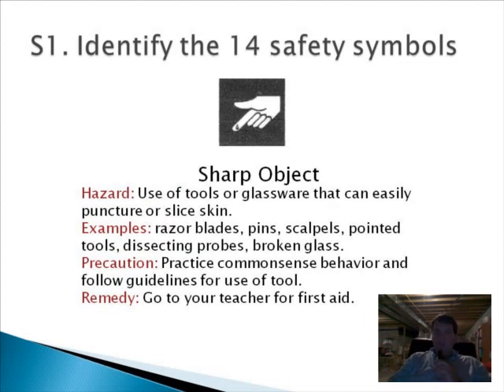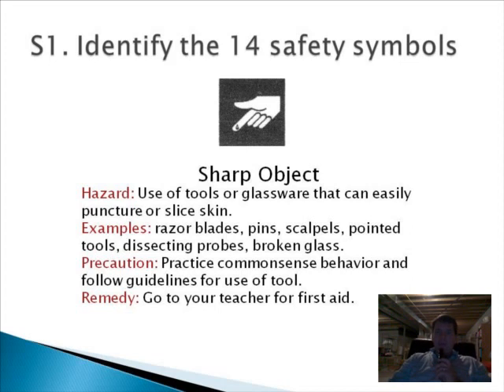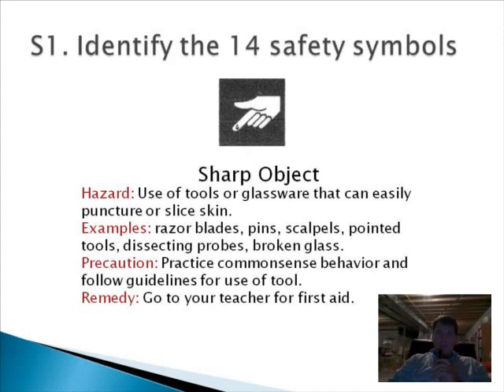The next symbol is pretty self-explanatory — it shows a finger with a little drop of blood on it. This is the sharp object symbol, which you see quite a bit in a science lab. A lot of our equipment is made of glass, and if dropped or knocked over it can break, creating sharp edges. This symbol indicates we're dealing with something that could puncture or cut the skin. Examples include razor blades, pins, scalpels, pointed tools, dissecting probes, and broken glass.